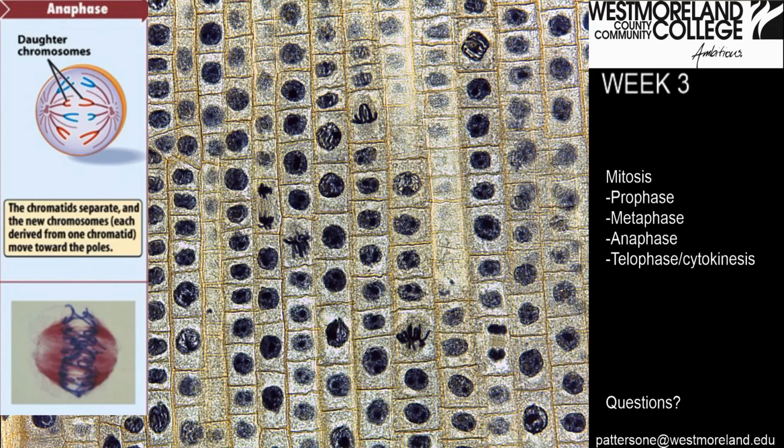We're looking for chromosomes that have been separated, and these two. They've been pulled apart. They're obviously away from the metaphasic plane towards the polar ends, and they have not moved on to telophase yet because we do not see that cleavage furrow. So these are still within anaphase.